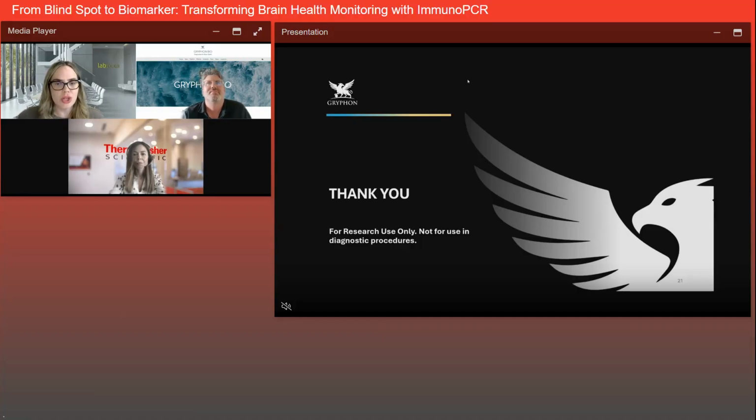All right, wonderful. So we will go ahead and wrap up with this last question here. This one says, what are some of the criteria you use to select protein biomarkers? Yeah, I think I alluded to it in my talk. One of the things we use is the trajectory analysis, kind of what is the time course of the protein biomarker in the indication, or as it crosses over from one indication to another, for example, TBI crossing into MCI or AD. Another criteria we use is we like to have a balanced panel of biomarkers that represents different brain cell types, like neurons, astrocytes, and microglia.